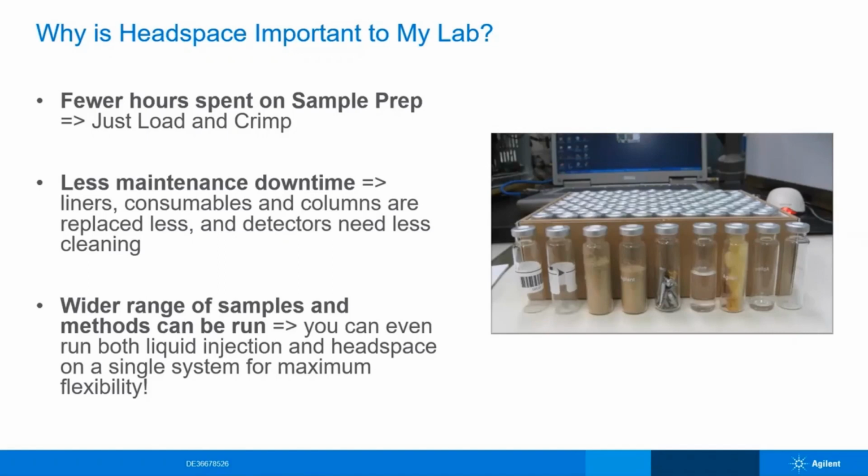Everything that goes into the vial that's a solid, that's not volatile, stays in the vial. Additionally, you just generally are going to have less wear and tear on your columns, fewer consumables switches, and your detectors, including your sources, just generally need less cleaning. Lastly, there's a wide range of samples that can be run on Headspace.